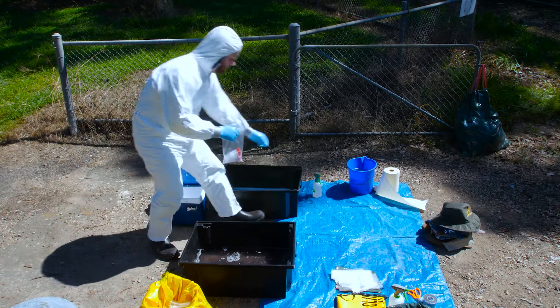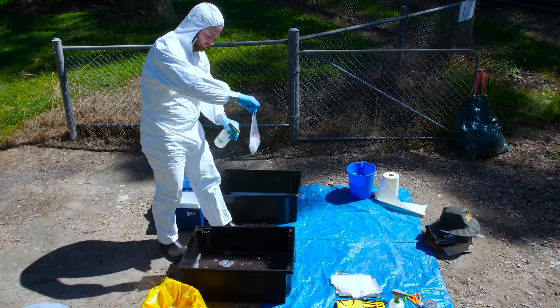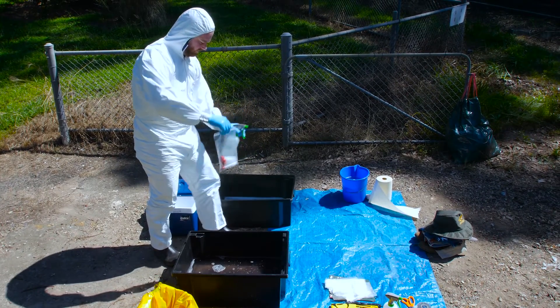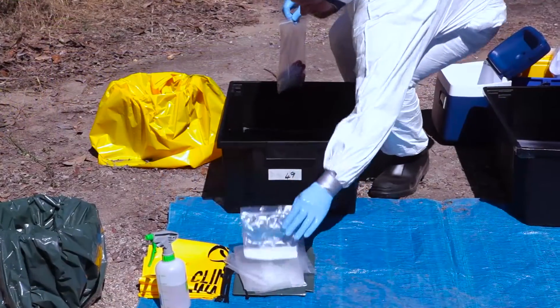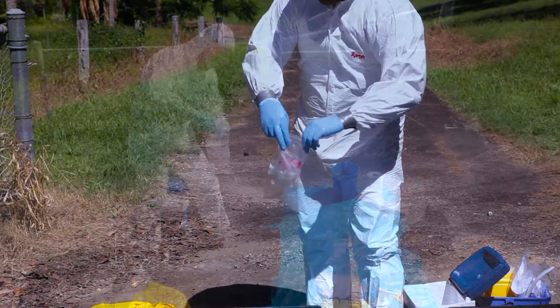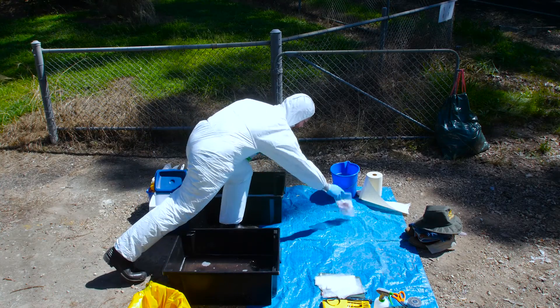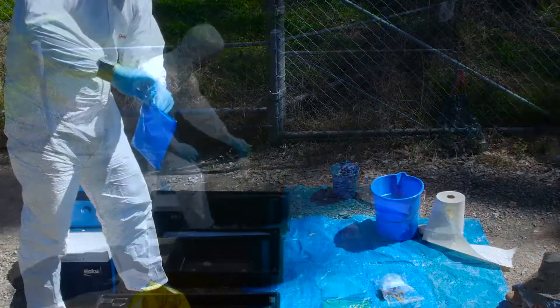Remove samples from the esky without opening secondary containers, for example ClipSeal bags. Carefully spray secondary containers with a disinfectant solution like Vercon, then double bag. Disinfect again and place across the imaginary line onto the clean side of the drop sheet.